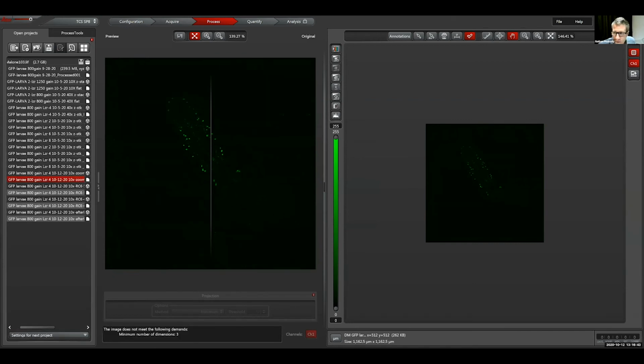You probably can't see anything right now, but I'm going into your file and just seeing. Okay, we've got a bunch of new ones for 10. Oh, that's right. When I do them all as a group, it makes new folders for everything, which is a bit annoying.